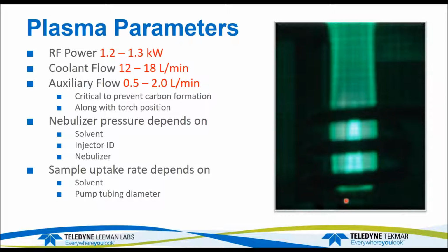And then when you get these really low maximum uptake rates, you have trouble with the peristaltic pump, because the peristaltic pump isn't going to work when you only want to do 1/10 of a mil a minute. So that's when you try it. You might have to go to the free aspirating scenario, and it also depends on the pump tubing diameter. For really volatile solvents, you may want to use really narrow pump tubing, so you limit the amount that you get up in there.